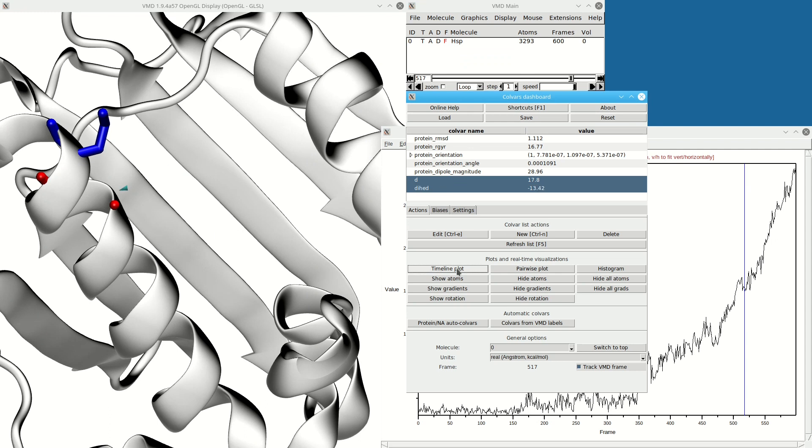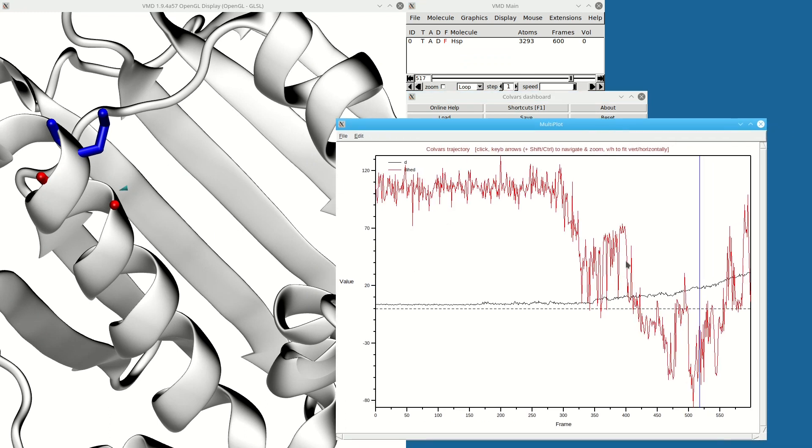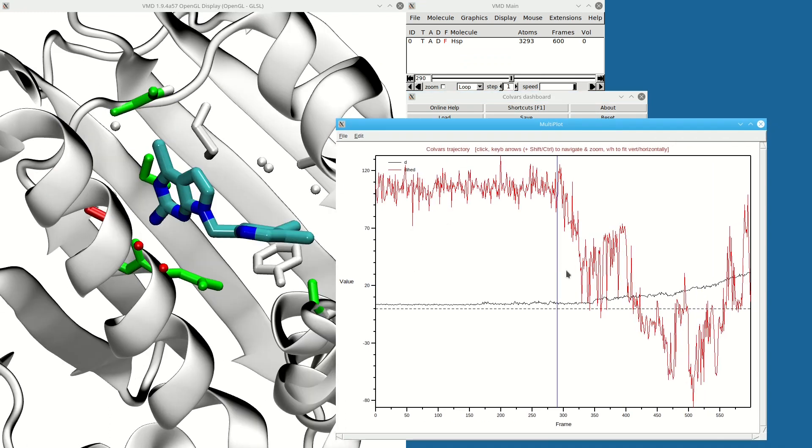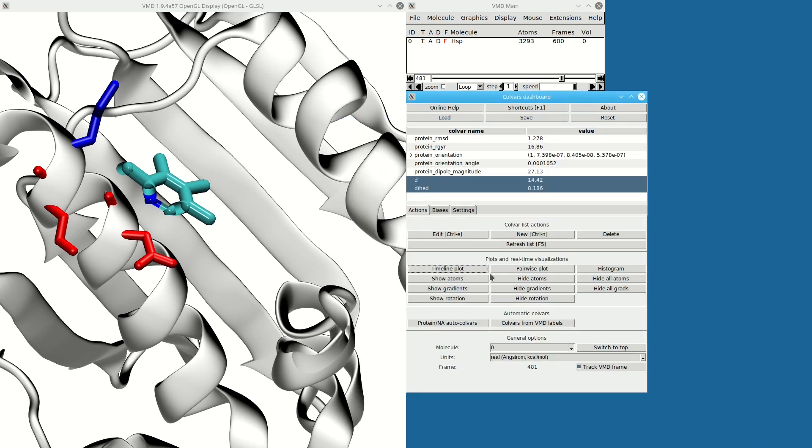If I click two variables, I can have a timeline for two variables at the same time. Here it looks like there might be a correlation between them, so for that I click pairwise plot.